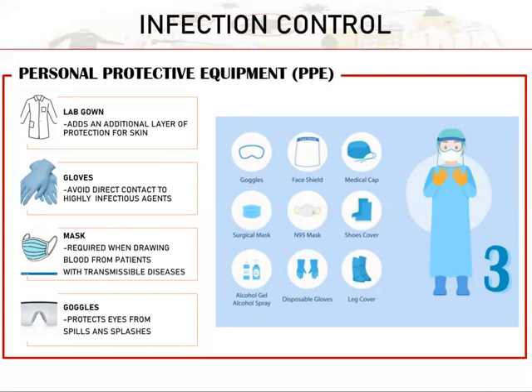So, why is the lab gown color white? It's because for us to see immediately if a blood sample or body fluid has spilled on our lab gown, so we can wash it immediately. Another one, our lab gowns, class, must reach the wrist of our hand. As much as possible, there should be no skin exposed when we are in the laboratory. So in case of chemical spillage or sample spillage, it will not be directly in contact with our skin.